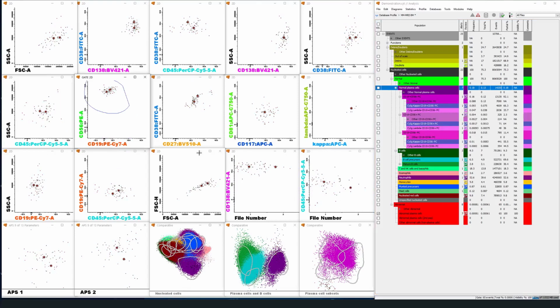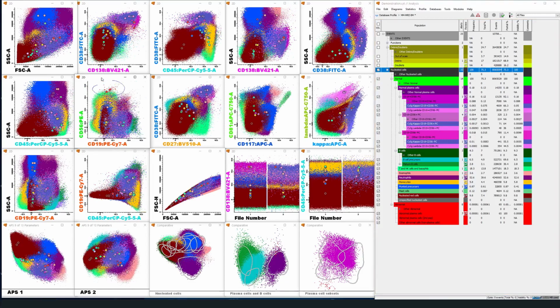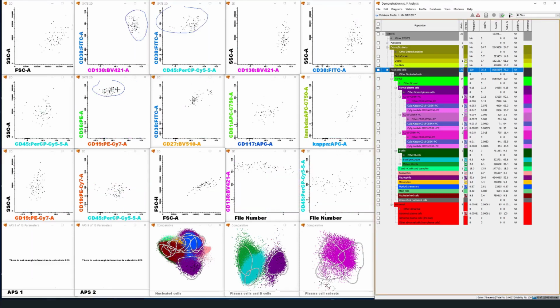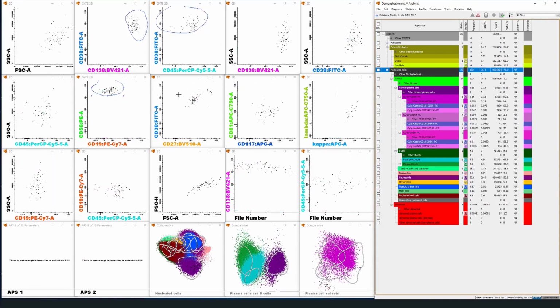We have 65 events, which is already above our level of quantification, but it's always good to look for more cells. What I like to do is bring up all the cells that you have available, and following the expected marker expression of these cells, gate somewhat widely around them, and see if there is anything that we missed from all the populations, which is usually faster than assigning them from every population.